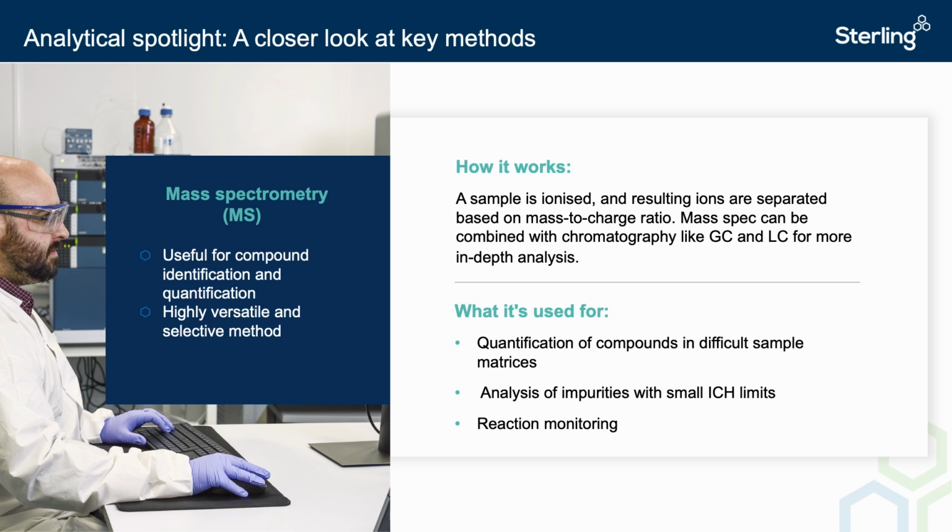In electrospray ionization, the sample solution is pushed through a small charged capillary. As the solution is charged, and like charges repel one another, the solution is forced into an aerosol mist. A surrounding stream of gases will nebulize the liquid and drive off the sample diluent.